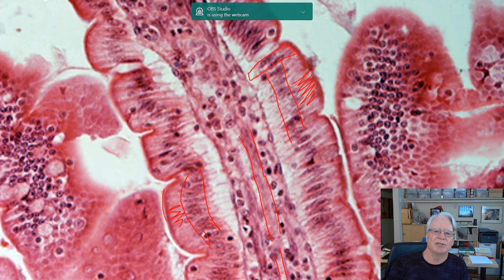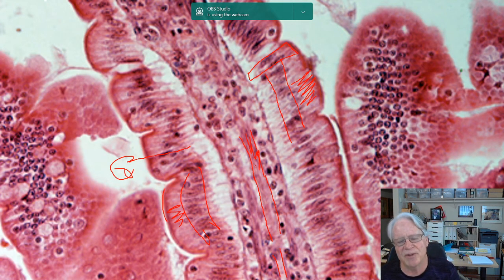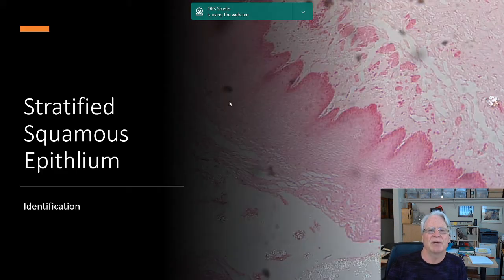And this is where you're absorbing the meal. So the meal out here is being absorbed into these cells, and then most of it goes into the blood. But some molecules, such as fatty acids, are too large to be transported into the blood, and so they get collected here in this duct, the lacteal, which is part of the lymphatic system, and then eventually return back to the blood. You'll learn about that in the digestive system.